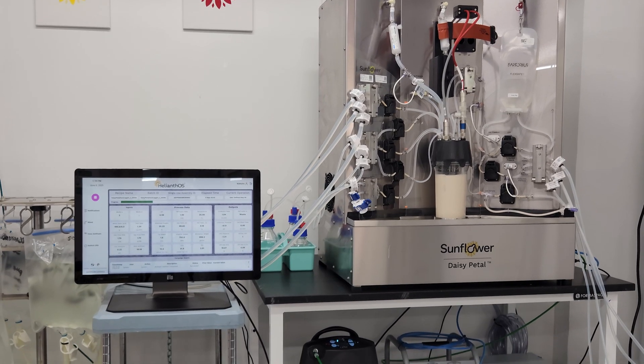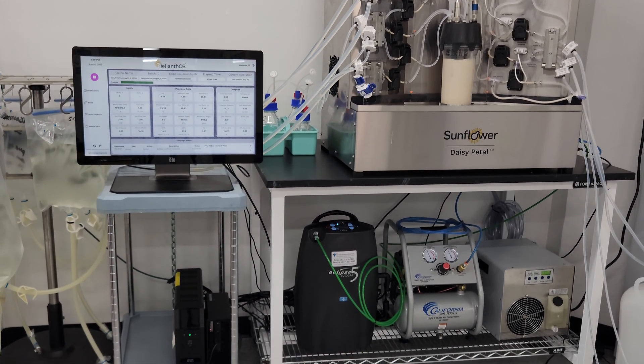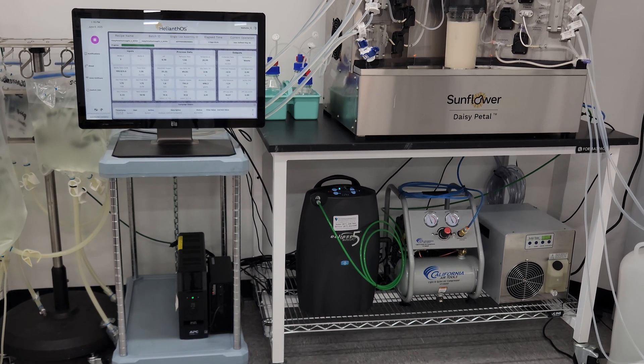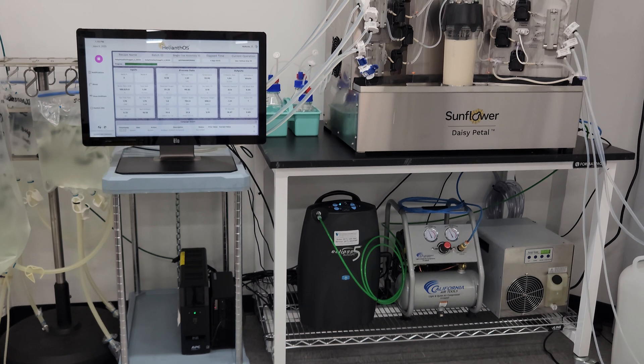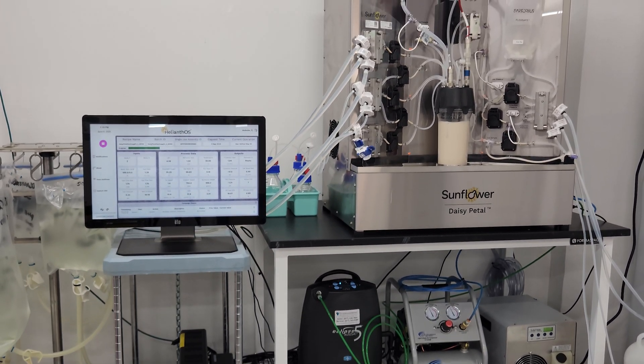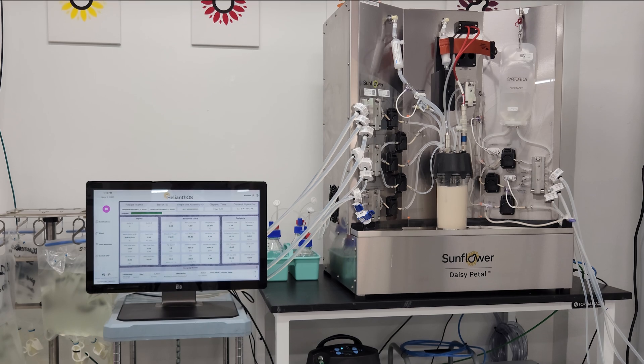In addition to the Daisy Petal itself, you will receive a monitor, a workstation, a data server, an oxygen concentrator, an air compressor, and a chiller — all pre-configured for use with the system. All of this equipment fits easily on a six-foot lab bench or an equivalent amount of space, as we have here.